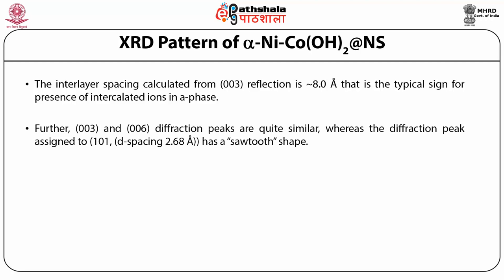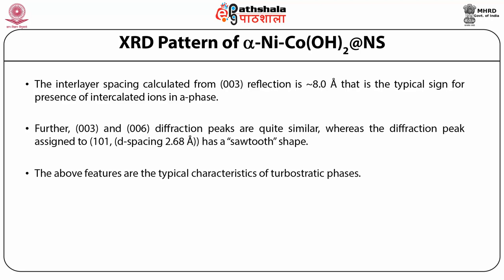Further, the 003 and 006 diffraction peaks are quite similar, whereas the diffraction peak assigned to 101, that is d-spacing of 2.68 angstroms, has a sawtooth shape, which is a characteristic feature. The above features are the typical characteristics of turbostratic phases.